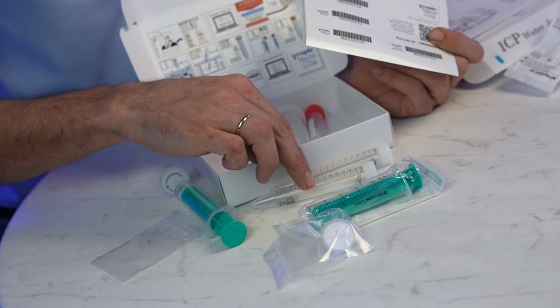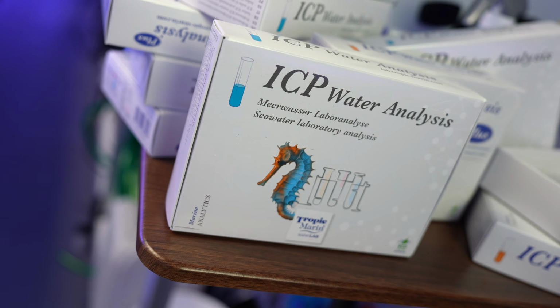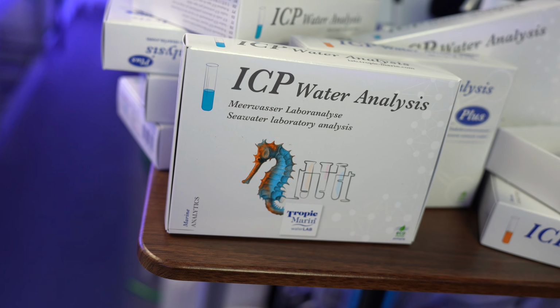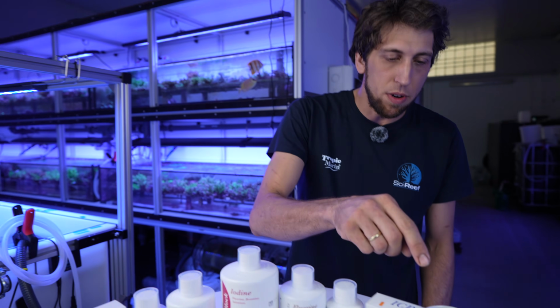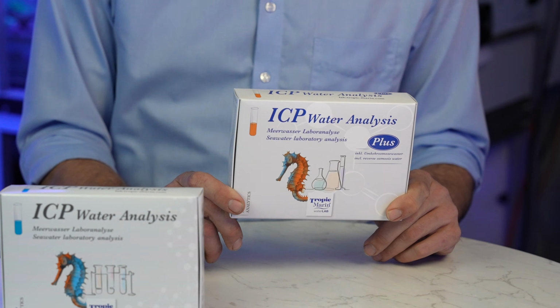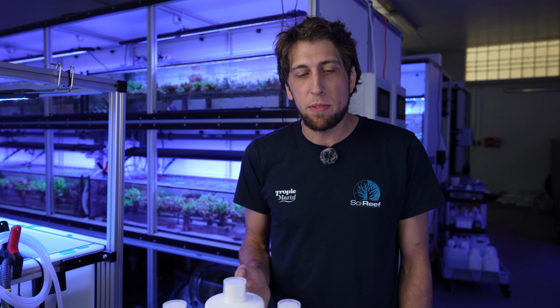Today we're going to talk about water chemistry once again. It's a very hot topic right now. There's a lot of development in analysis methods and products on the market, of course. Two versions of their ICP analysis: the ICP water analysis that gives you all the elements that can be measured with the ICP, and one that gives a little extra, like elements that you cannot measure with the ICP, nutrients and all the general parameters. But there's also a video here on that channel, so feel free to check that out.